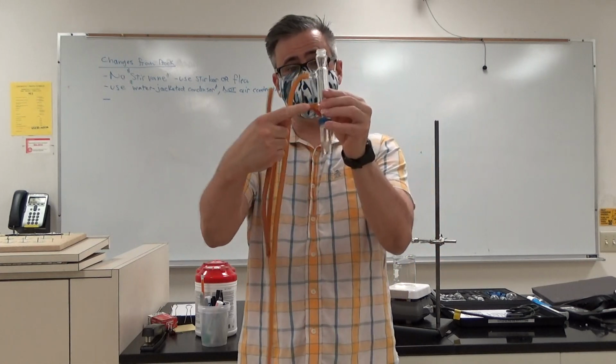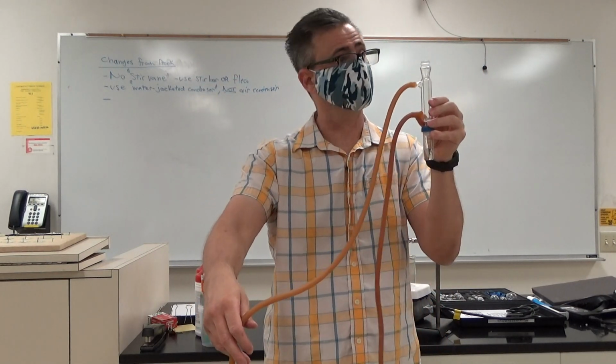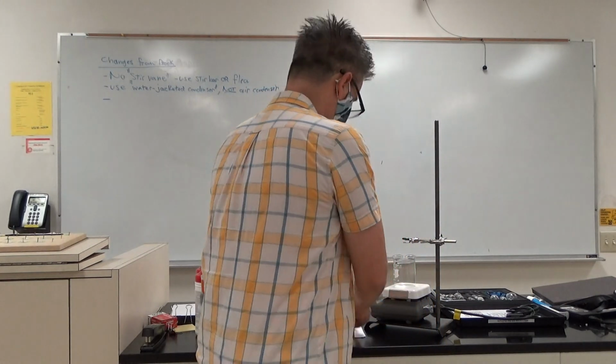So in the bottom spout, out the top spout, and then this top spout drains into the drain of the sink. Okay? When you turn these guys on, always be sure to use 2 hands, because if you use one hand, it goes from 0 to fire hose. And inevitably, somebody won't listen to me this year and will use one hand and will give their neighbor a shower even though they already have one today.